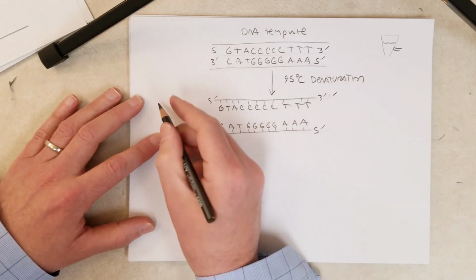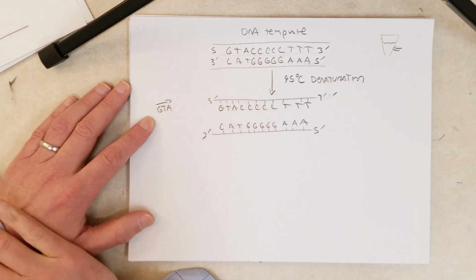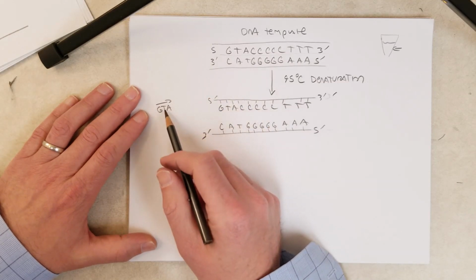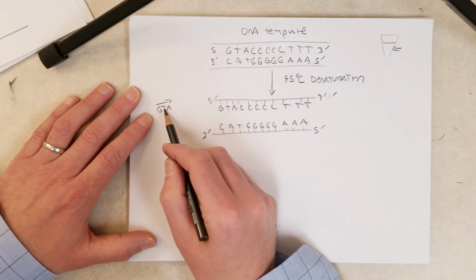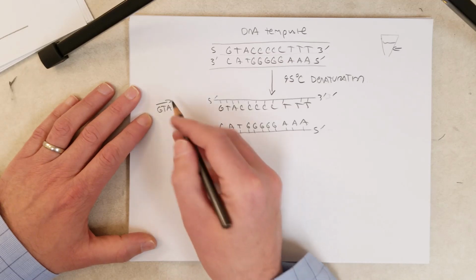Now also in there, remember we added the primers. For this example, I'm going to assume the primers are 3 nucleotides long. That's way too short to work well as a primer. Usually primers should be at least 20 nucleotides long, and they could be as short as 18 and as long as like 50 nucleotides, but three is going to be way too short. But again, I just want to introduce you to how PCR works conceptually.